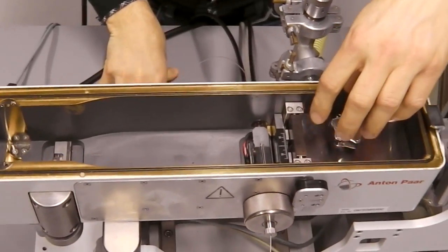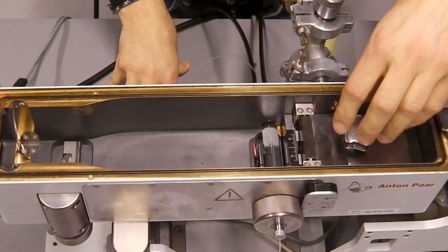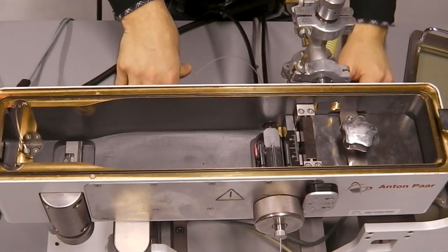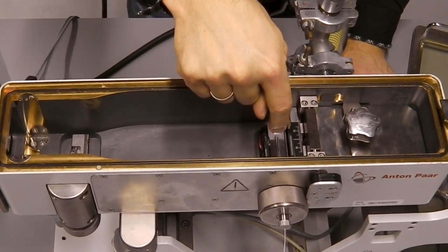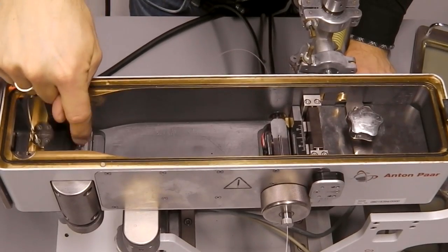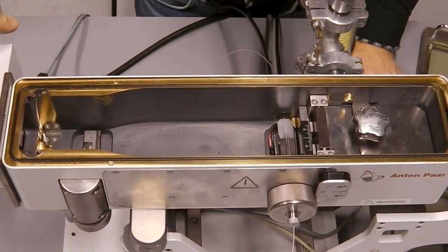There is a collimation block which cuts off the X-ray beam to the shape that we want, a sample position with a temperature cell, and a beam stop with a detector at the very end.